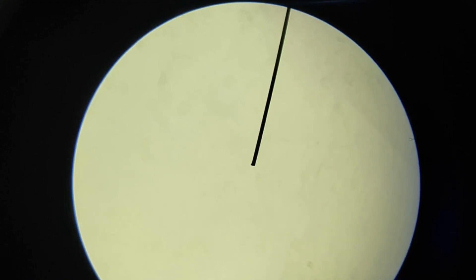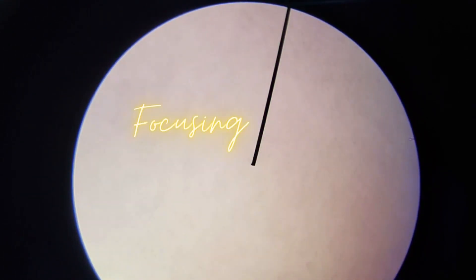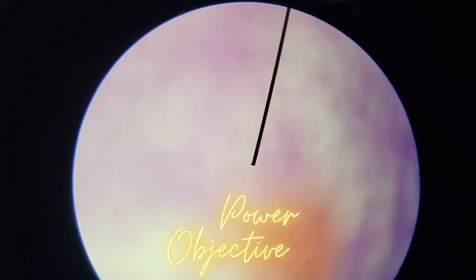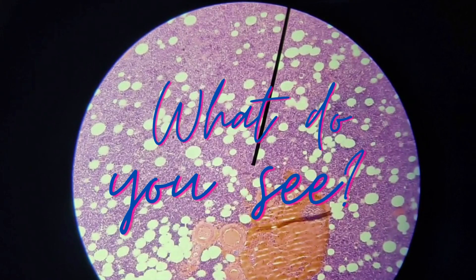I'm going to use the coarse adjustment knob. I'm making the stage go up toward the low power objective, and as you can see, an image is going to show up, such as this.